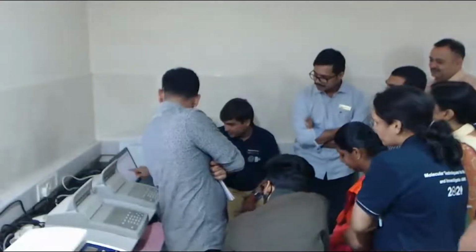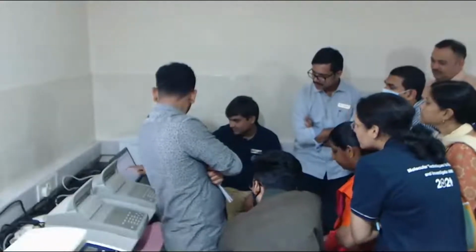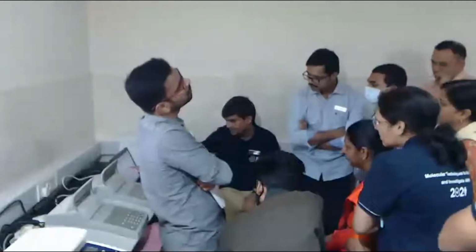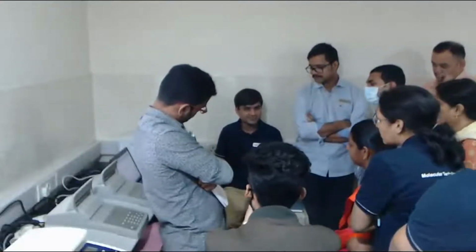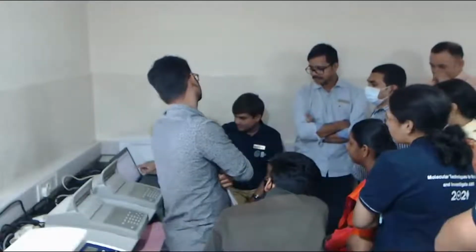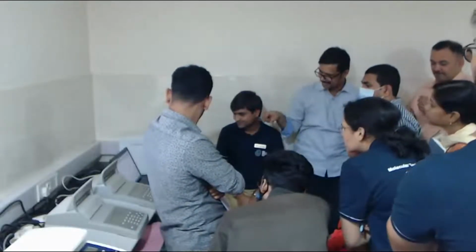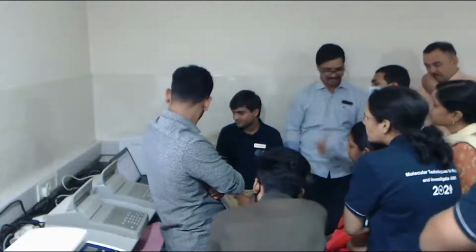But then again, if you look over here, this 400 base pair band is present in all. Then over here we have more than 300 and a little bit lesser than this is present here, here, here. So since your targets are the same, even though your sample might be having them or not, that can be reflected. The third and fourth are very distinct, but the other ones are somewhat faint. Apart from that, you may be having other fragments.